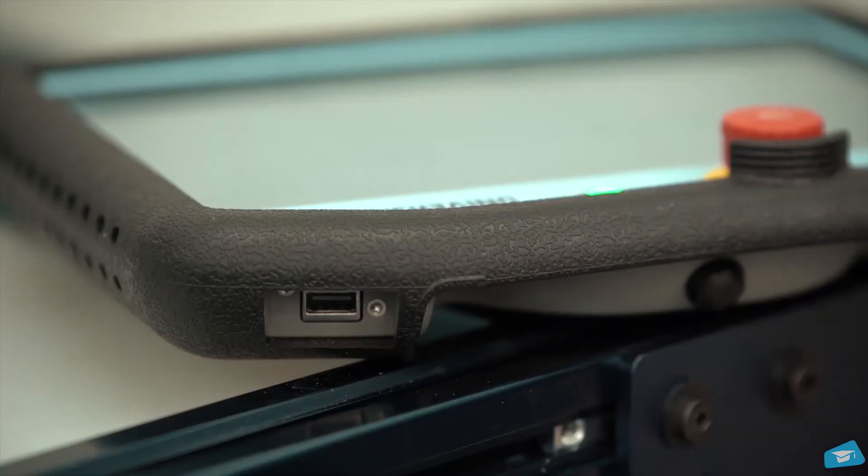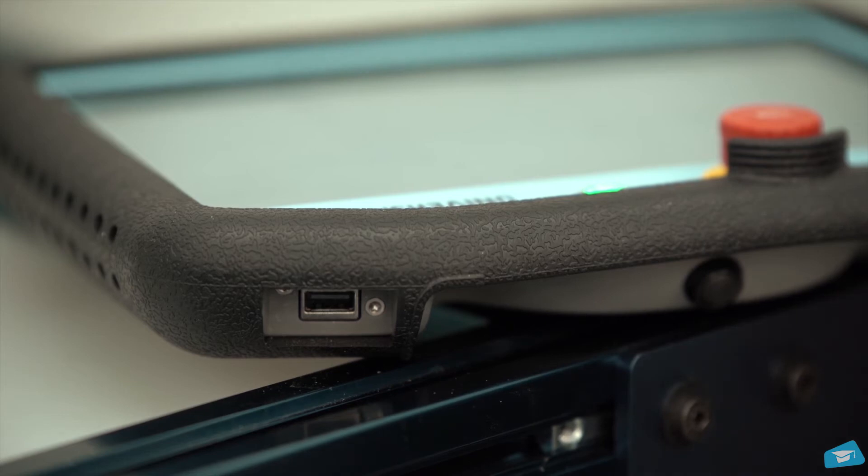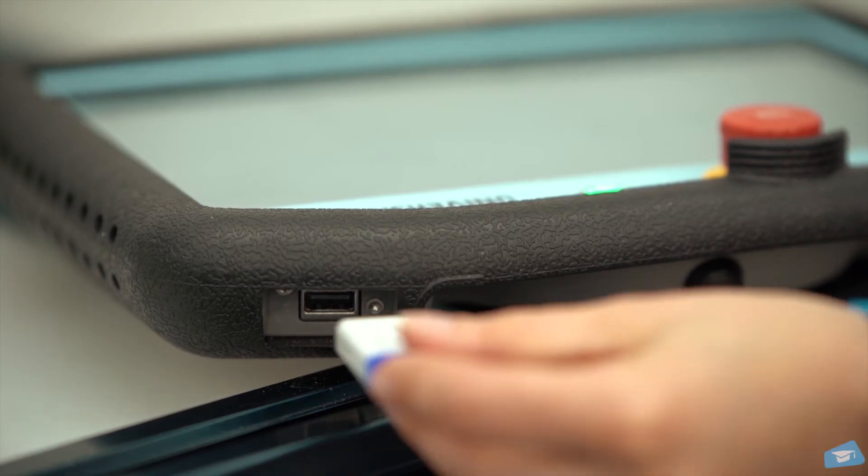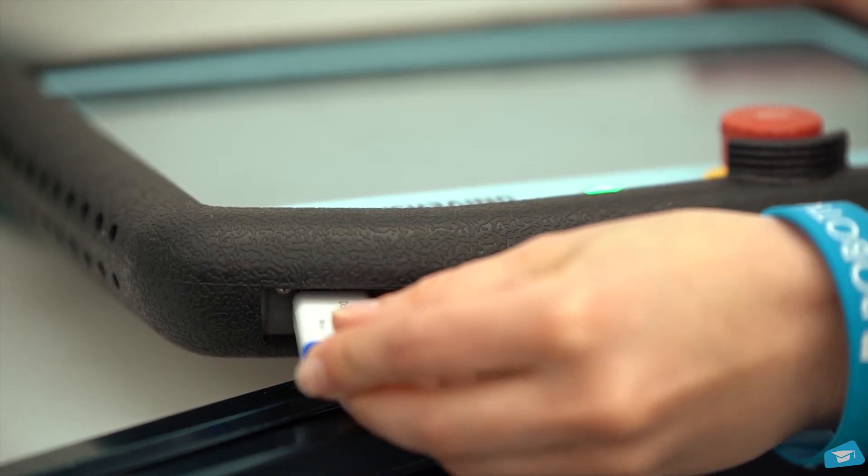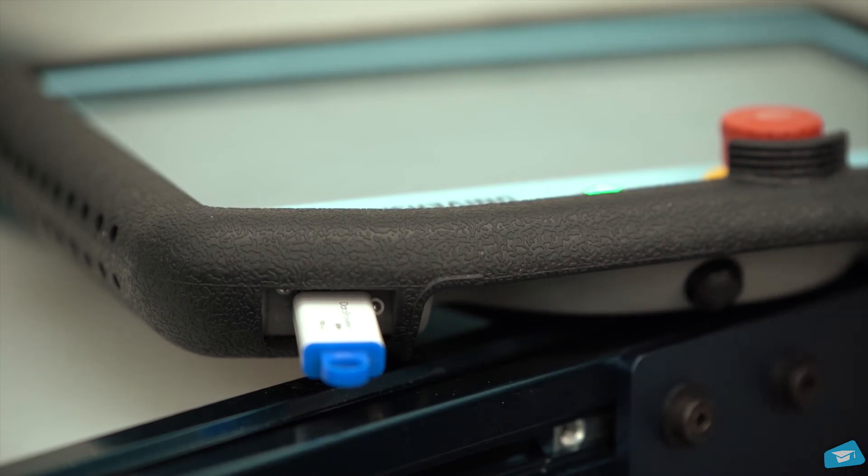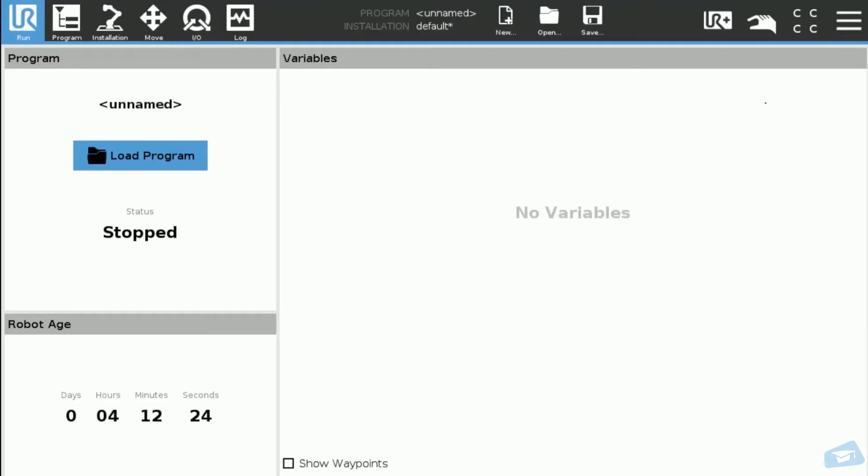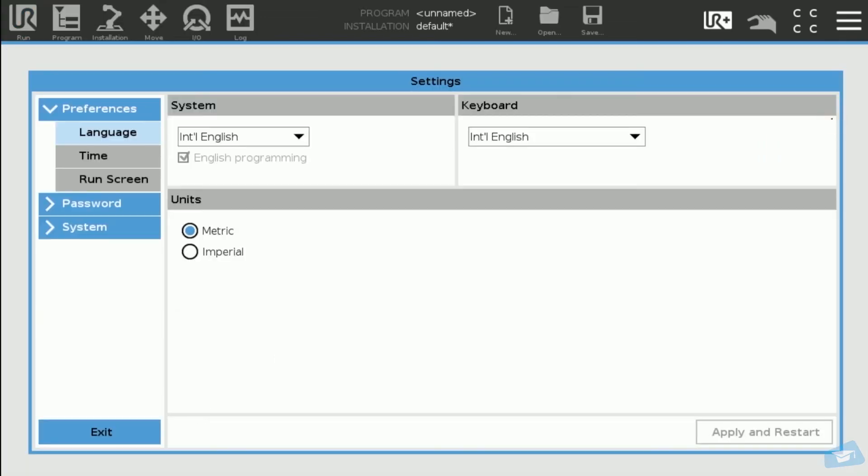Connect the USB storage device to the robot teach pendant. In order to install the UR Cap, tap the triple bar icon and select Settings.